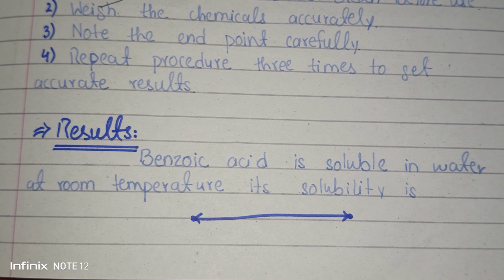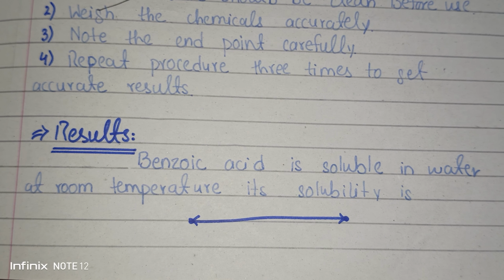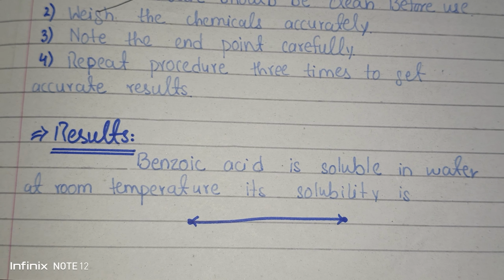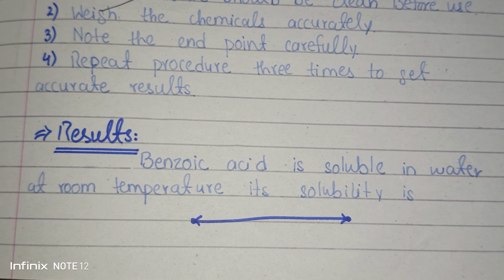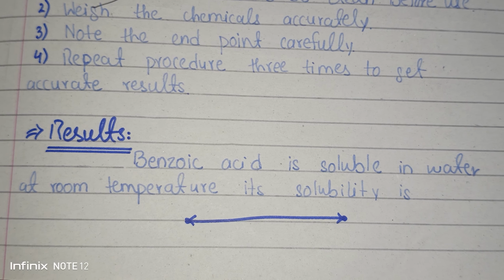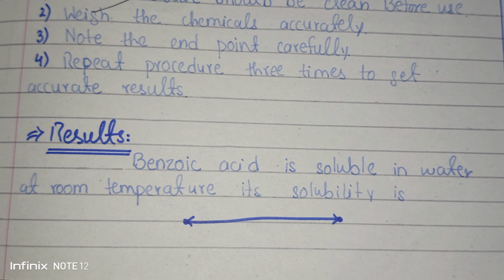And also you mention the result in the last, that benzoic acid is soluble in water at the room temperature. And you will also write the value of its solubility. So now we move on to its calculations.